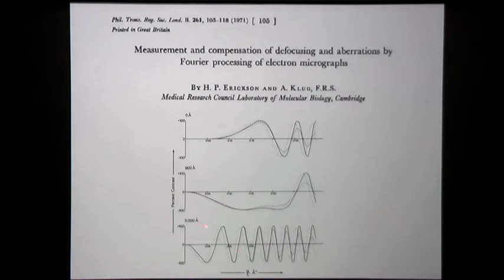You'll hear a lot more about this. They're called contrast transfer functions, or CTFs. And as I said, this is going to come up a lot during the course. Now, because this thing wiggles, it goes negative and positive and negative and positive. This means that the spatial frequencies are, unfortunately, transferred from the object to the image with alternating contrast. So it might be white contrast here and black contrast here and white contrast. So although you're transmitting information about the object to the image, you're doing it in such a way that different frequency bands get inverted in contrast, and black becomes white and white black.